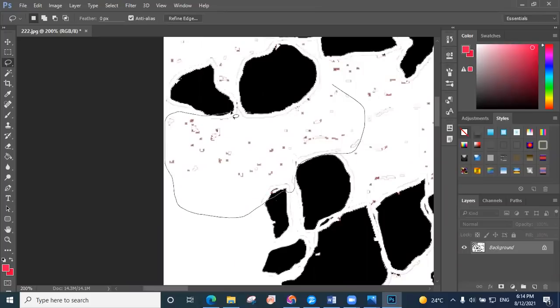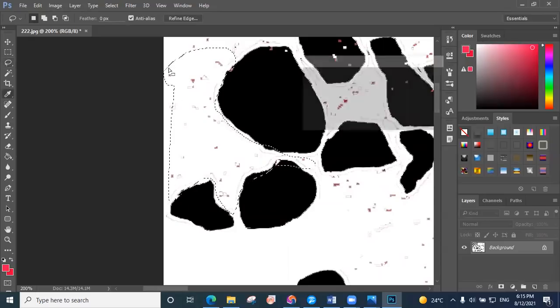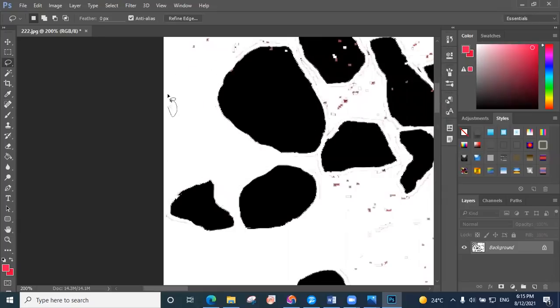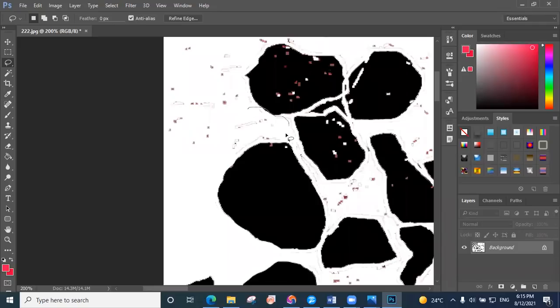And there is another method. If you have this issue, you can just calculate directly and then filter the values. For example, if you know the grain size has a specific value, or maybe in this ring, just filter out the grains which have a smaller number.